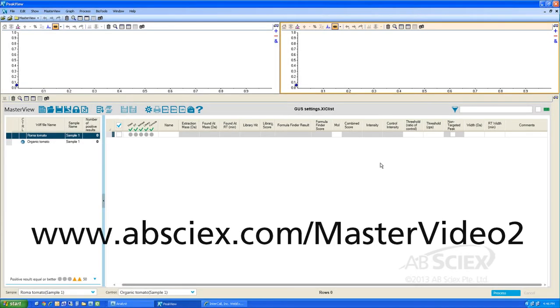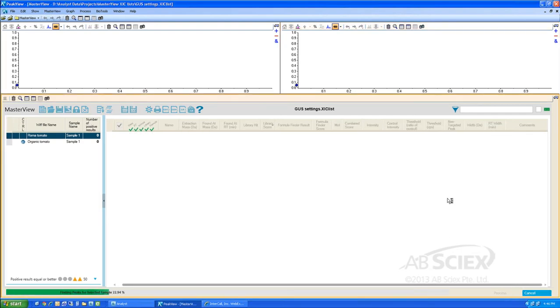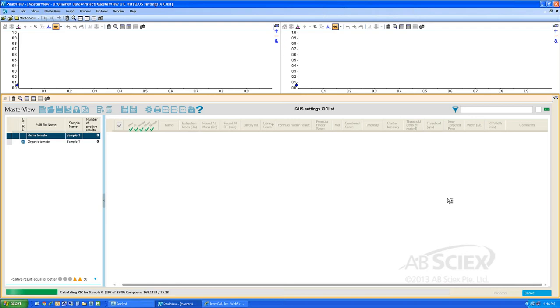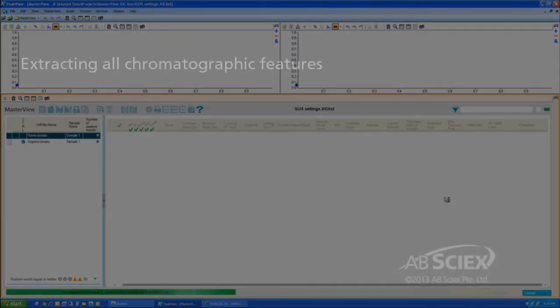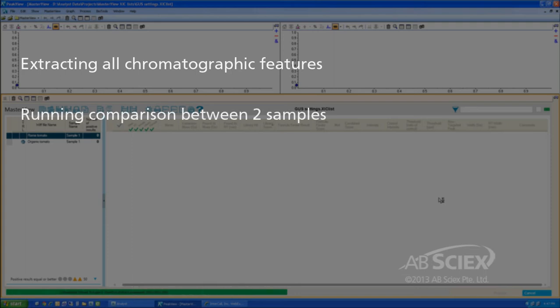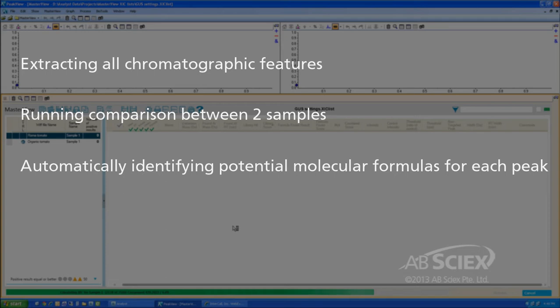View our previous video in this series to learn about setting up the processing parameters for this type of analysis. We then click the Process button to start processing our data. During the processing, the software is going through both data files to find all chromatographic features and compares the peaks between the two samples. The software will also automatically propose a suggested molecular formula for any peak that is detected using the formula parameters we entered in our data processing settings.